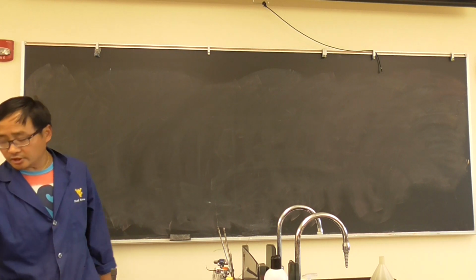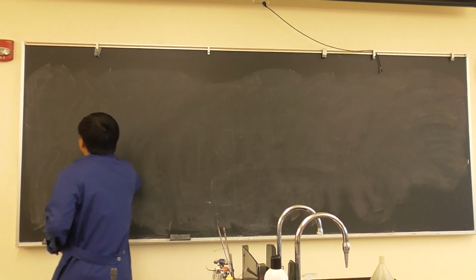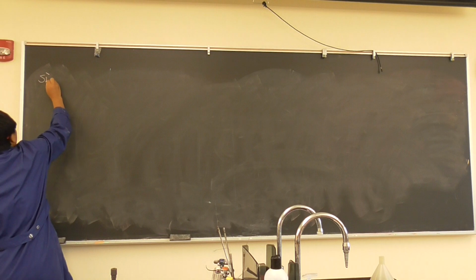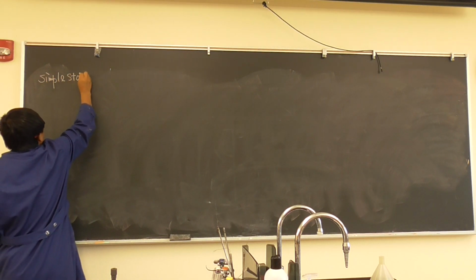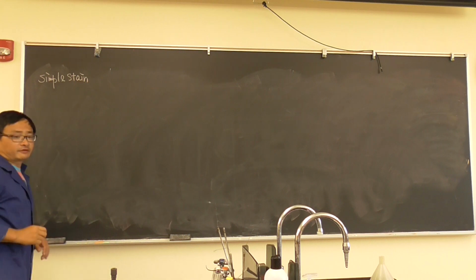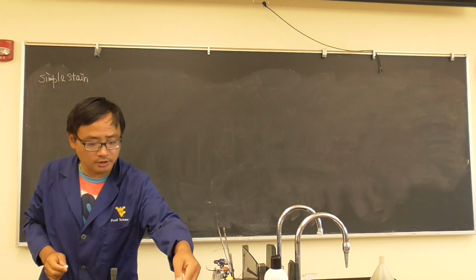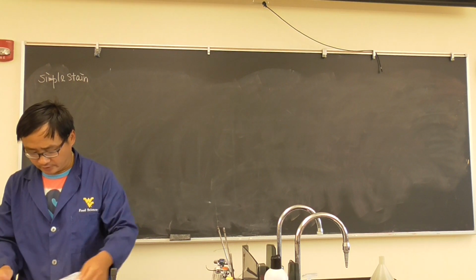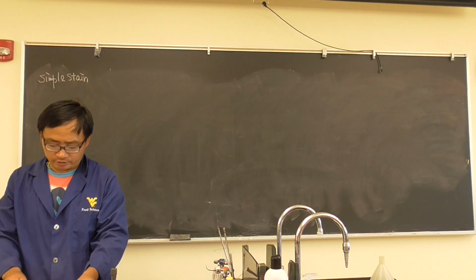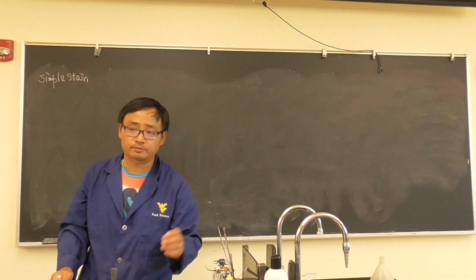Okay, let's start class. We'll have our second lab today. So we will do simple stain. And you have a fact sheet that will be chapter 3, I believe. Yes, chapter 3. Smear preparation and simple stain practice.